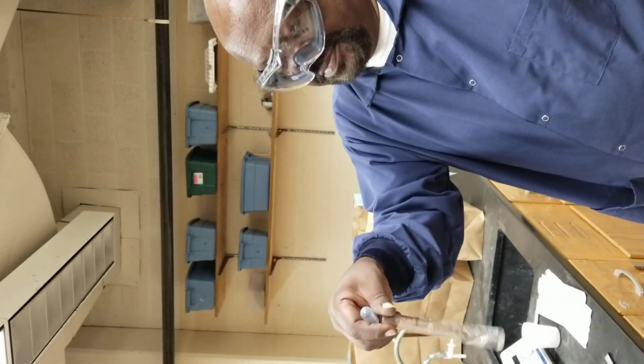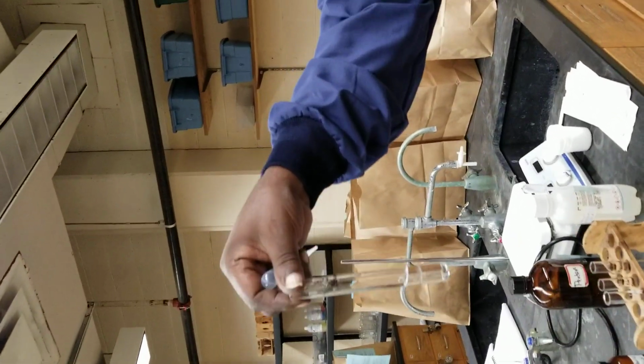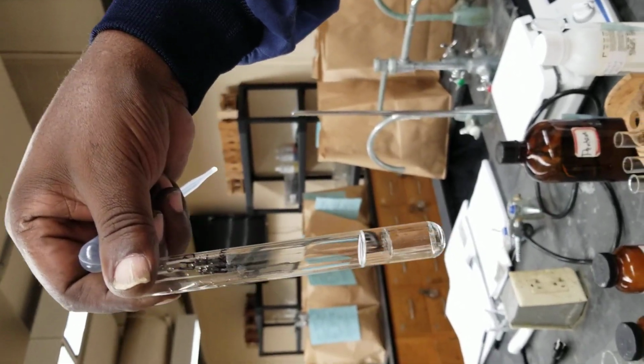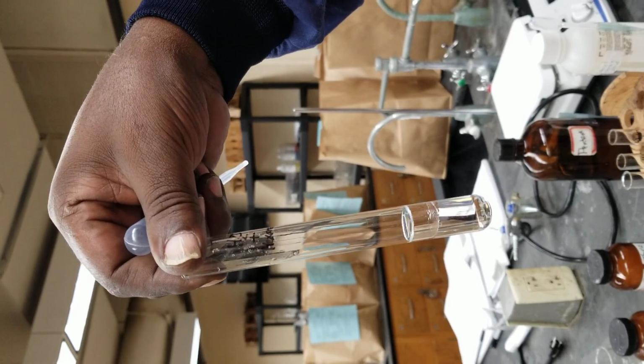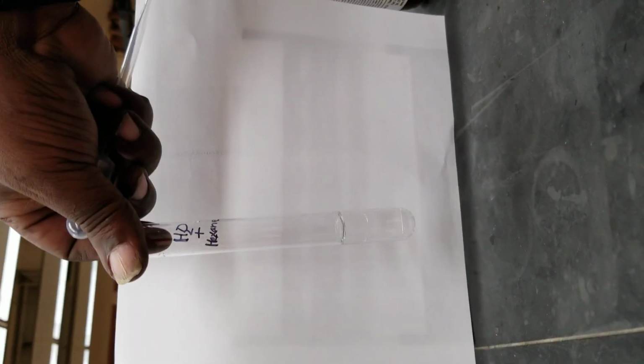Encourage formation of solution by shaking, and in this case, just as you might expect, you get a layering of two different layers. We know oil floats on water, right? Yeah, even I know that. All right, moving along. Can you explain that? Yes, you can.